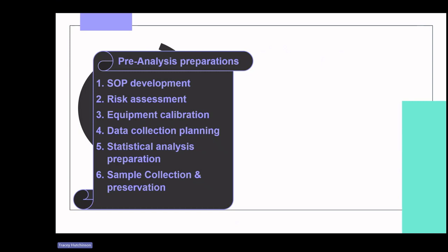And finally, you would instruct students on proper procedures for collecting water samples, emphasising the importance of aseptic techniques to avoid contamination, and provide guidelines for sample preservation, considering factors like temperature, storage containers, and the addition of preservatives. So that would be the pre-analysis preparation.